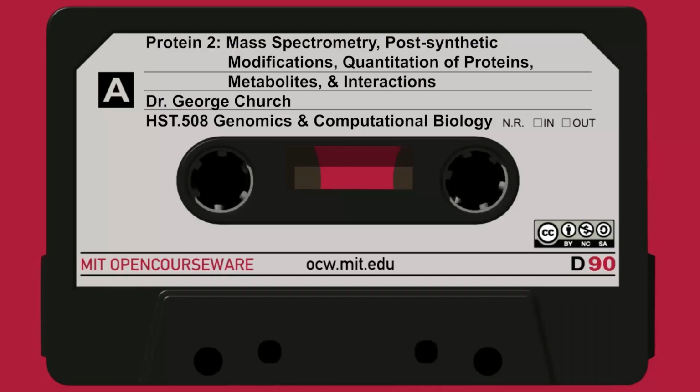So if you take the entire yeast proteome, grind up yeast, throw it on a first separation dimension, which is sedimentation velocity. Remember, there's equilibrium and velocity. Velocity is mainly responsive to the size of the complex. This is a native dimension. We're not denaturing with SDS, native.